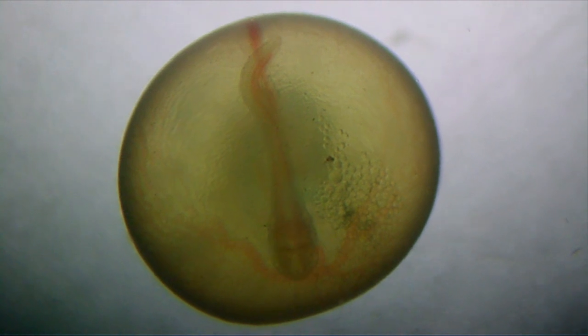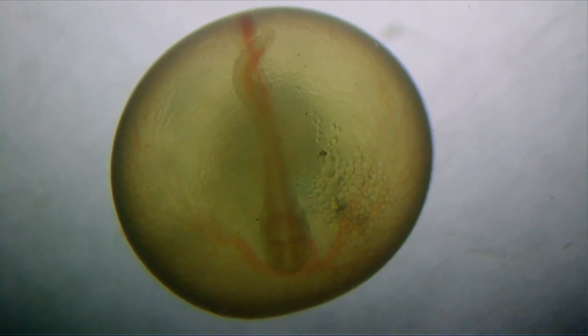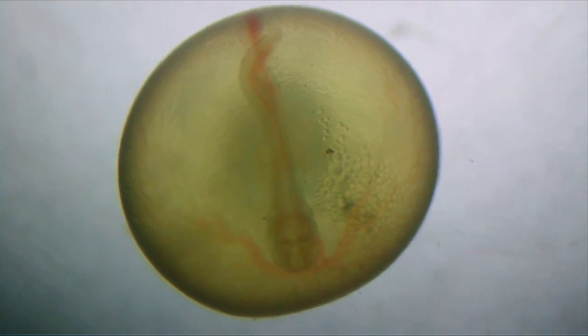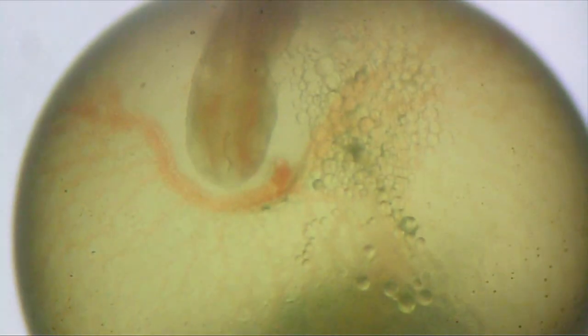You can also see the small tail that is still free and developing, but it's still contained in the membrane of the egg. There's also a section of oil droplets that have coalesced, and that's forming part of the yolk, which becomes food for the fish as it develops.